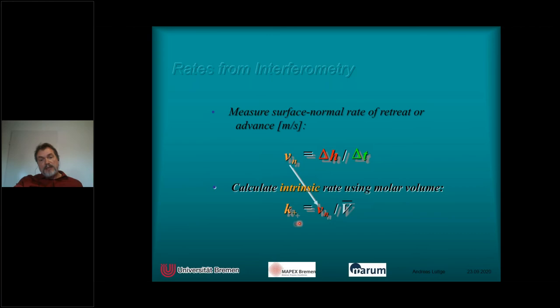That is a real tricky part, as many of you may know. You can use BET technology, but you know that if you use different gases, then we get different answers. If we use geometric surface area versus total surface area, you always get a different answer for the total surface area that you would need to normalize that, because we have moles per meter squared per second. In this case, with this approach, you have circumvented that problem entirely.